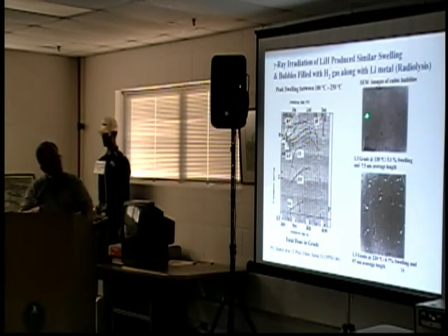But they also took samples, and these are SEM images. And at 1.3 gigarads at 120, they got 5% swelling, and what they have are really small bubbles. I'm afraid they don't repeat, but they're roughly 7.5 nanometers, 75 angstrom. However, if you were at 220 degrees C, now these bubbles have grown so that they're 57 nanometers, 570 angstrom, and they're actually cubic little bubbles. So lithium hydride, the cubic material, and so there was a correlation between bubble size and NMR relaxation times that Clark Sowers and his folks worked out on a hydride.